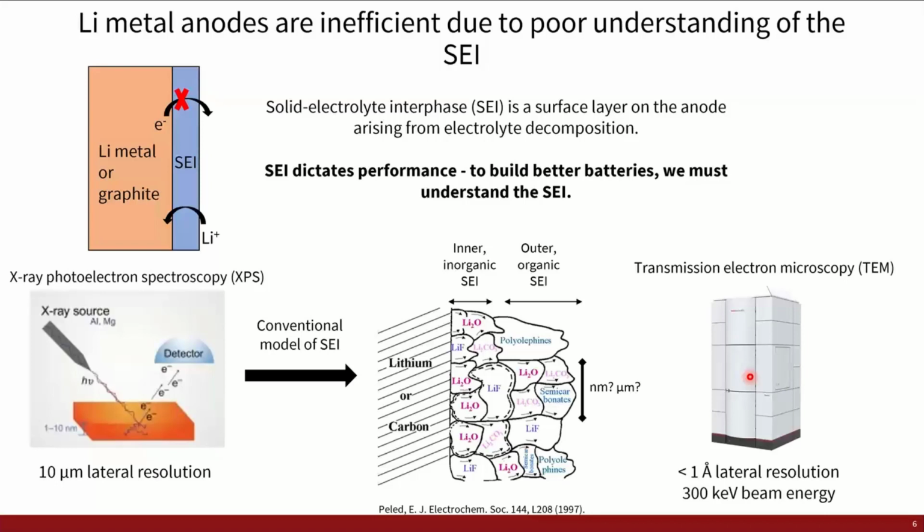For materials where you're sensitive primarily to sputtering or knock-on damage, such as graphene or 2D materials, low kV is generally thought to be a good thing. But what we found for lithium-based battery materials is that you actually get more beam damage at lower accelerating voltages. At 300 kV accelerating voltage, we found the least amount of damage to lithium metal.